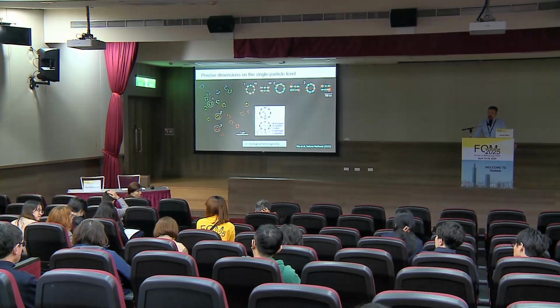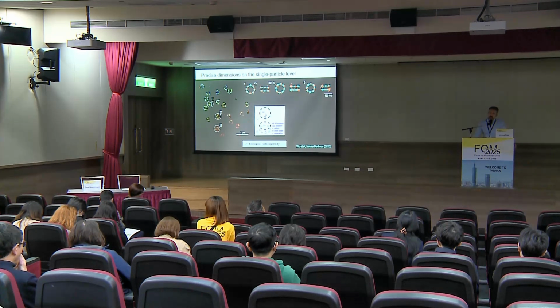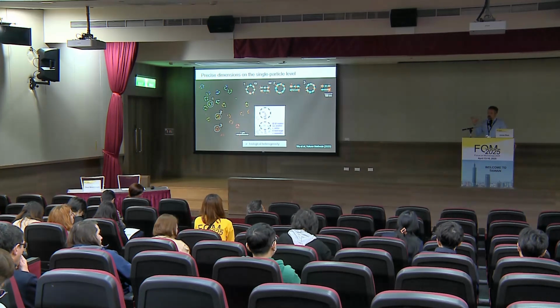What would be the smallest spectral shift that we would be able to differentiate with ratiometric imaging? So it depends always on the number of photons you detect. And often these environment-sensitive dyes, they're not the dyes that give us the highest photon counts. But if you detected 1,000 photons, I think some 10 to 50 nanometers could be resolvable. I think it's very easy to estimate this just looking at the Poisson noise and looking at the error one does in the ratios. Also, it depends what accuracy you need in your spectral measurements.